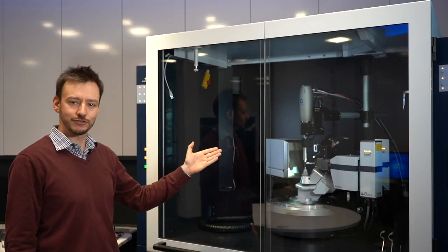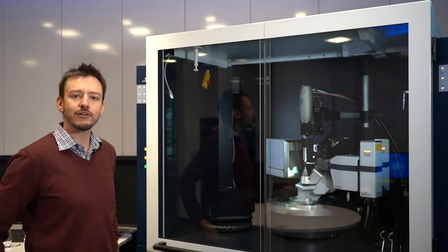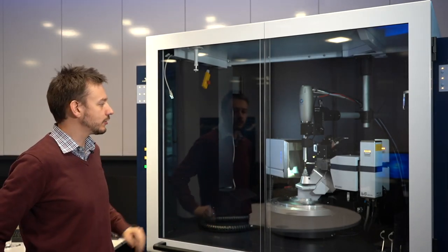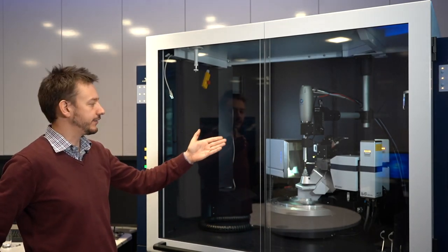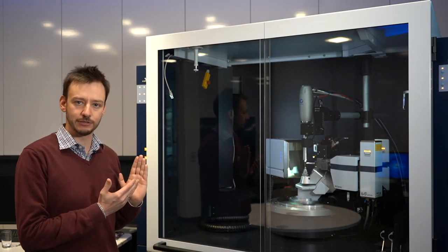This is my D8 Venture Duo system with a copper source in front and a moly source in the back. For our absorption experiment we are going to use the moly source and therefore I also remove the beam stop because we want to use the direct beam to do our absorption experiment.